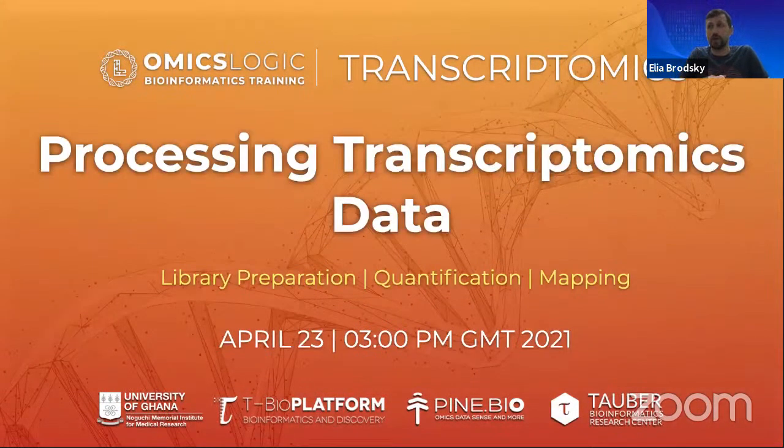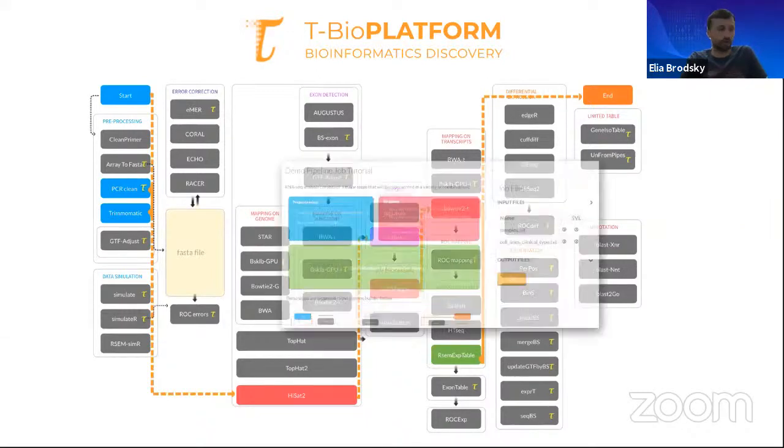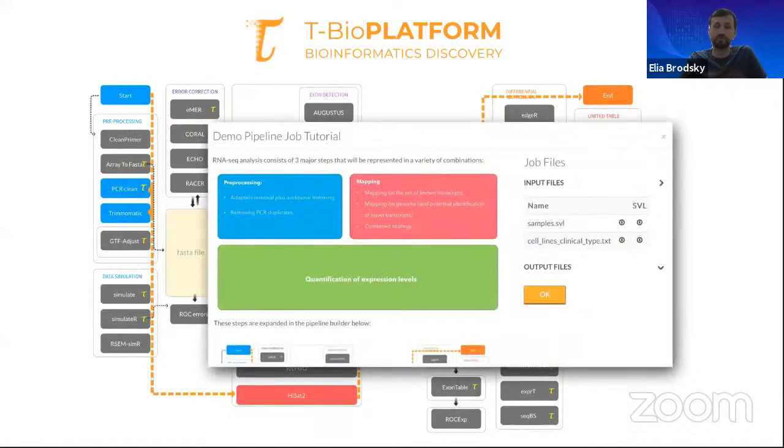So we'll start off by talking about processing transcriptomic data. We'll talk about how this data is generated, what is in this data, what we are looking for, what is the logic behind what we can do with this data, and what are some of the steps that we could consider depending on what we are trying to accomplish in our analysis overall.